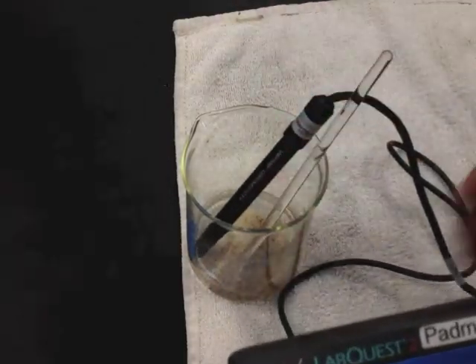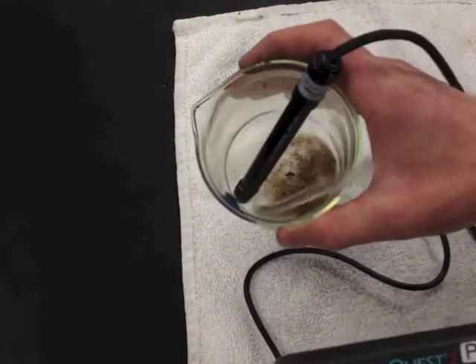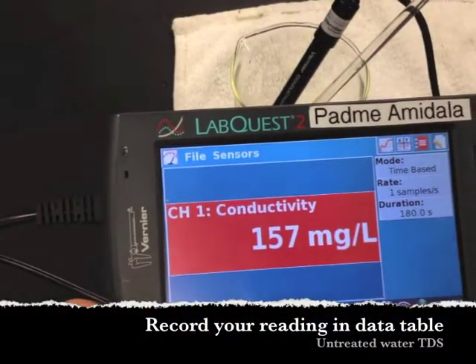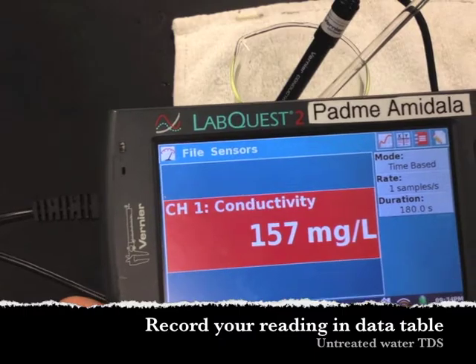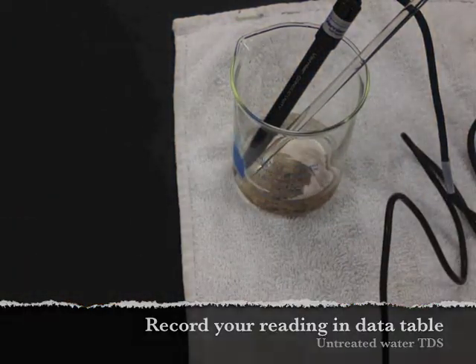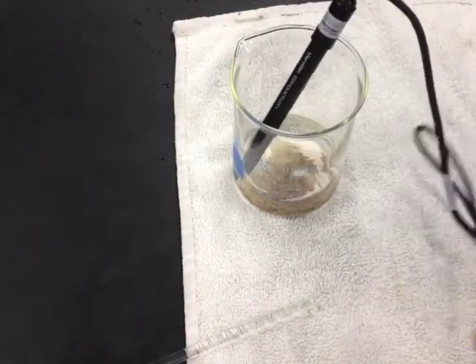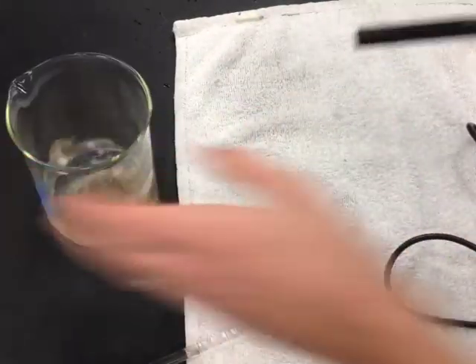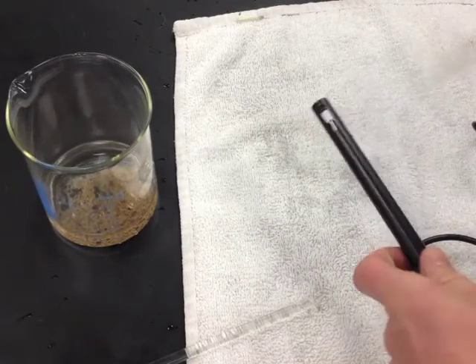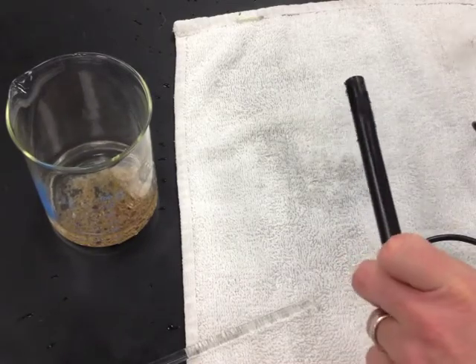In the water I'm testing, the conductivity is reading at 157 milligrams per liter. I'm going to record that in my data table. Please make sure to rinse off the conductivity probe after every time you use it — get in the habit of doing that with the conductivity probe and the pH probe as well.